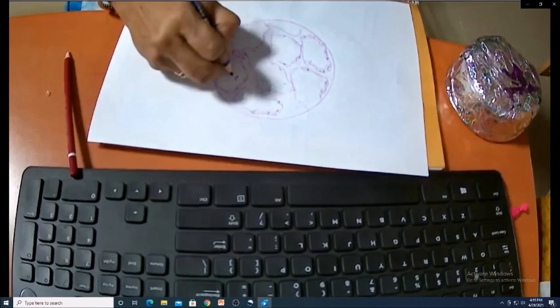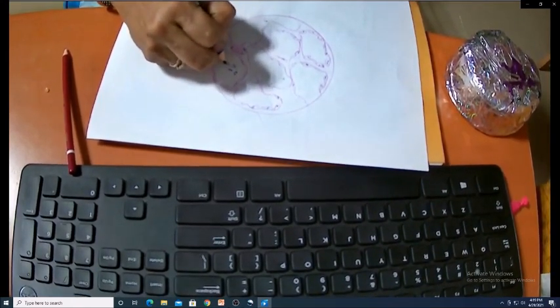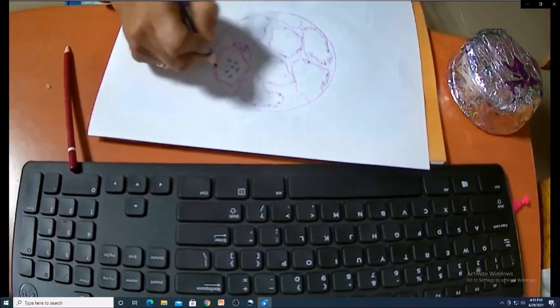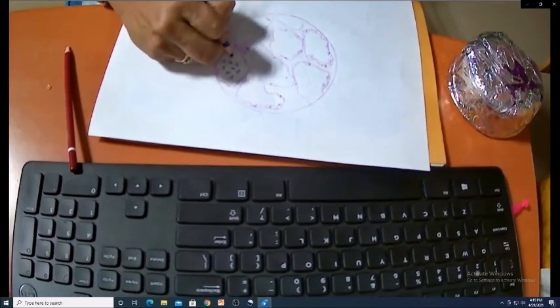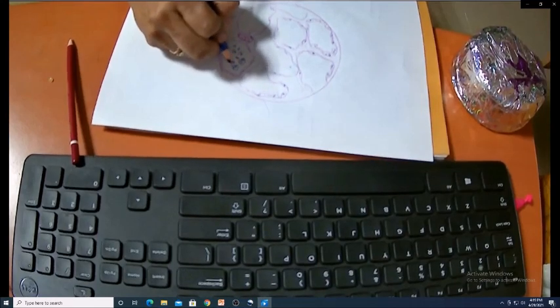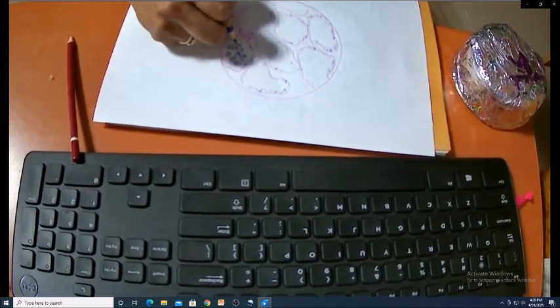So I have taught you how to write neutrophils. Whichever way, you can put an outline of the cell and then draw the nuclei. But here I am just showing segmented nuclei, most of them having 3 lobes only. And then I'll write the cellular margin using the same color.